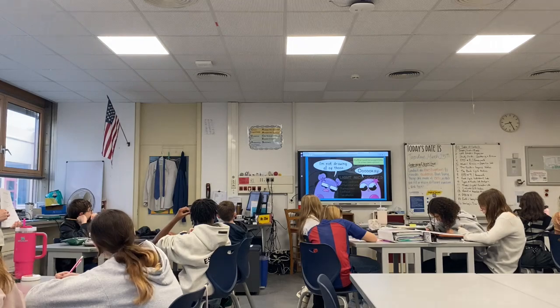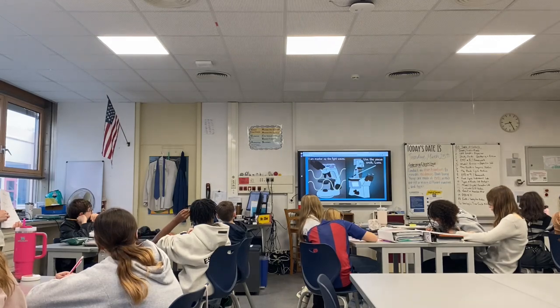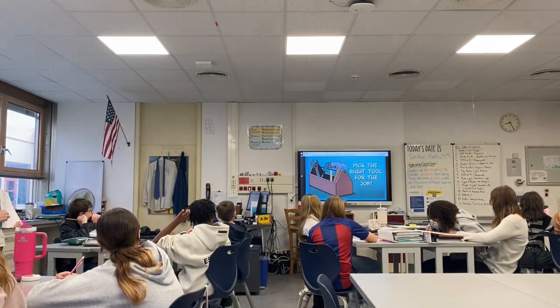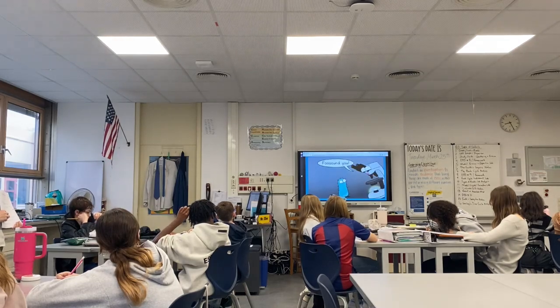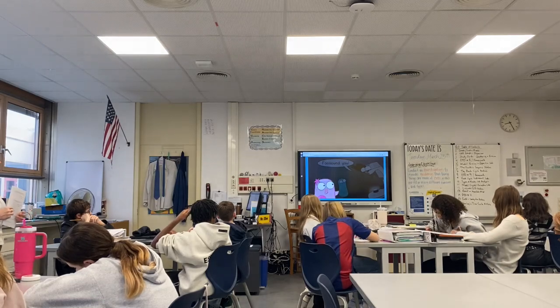And some of these are fascinating. Some rely on interference, some rely on using a laser, but the thing to keep in mind is there are certain times when one of these types of light microscopes is more ideal to use than another. So light microscopes use light in some form to see a specimen. But not all microscopes are light microscopes.